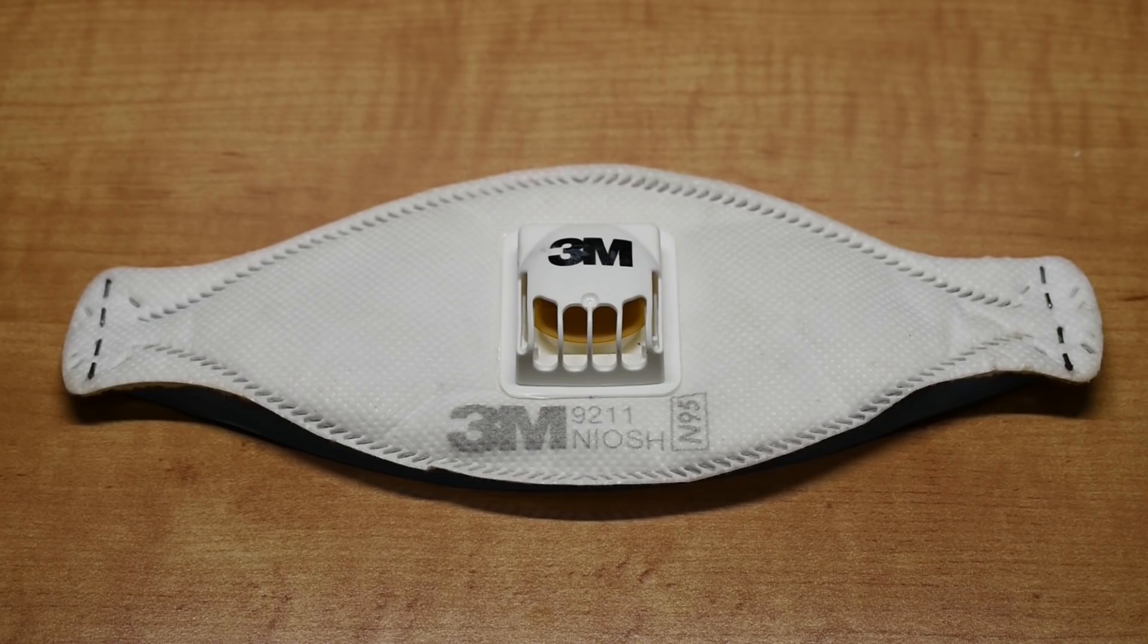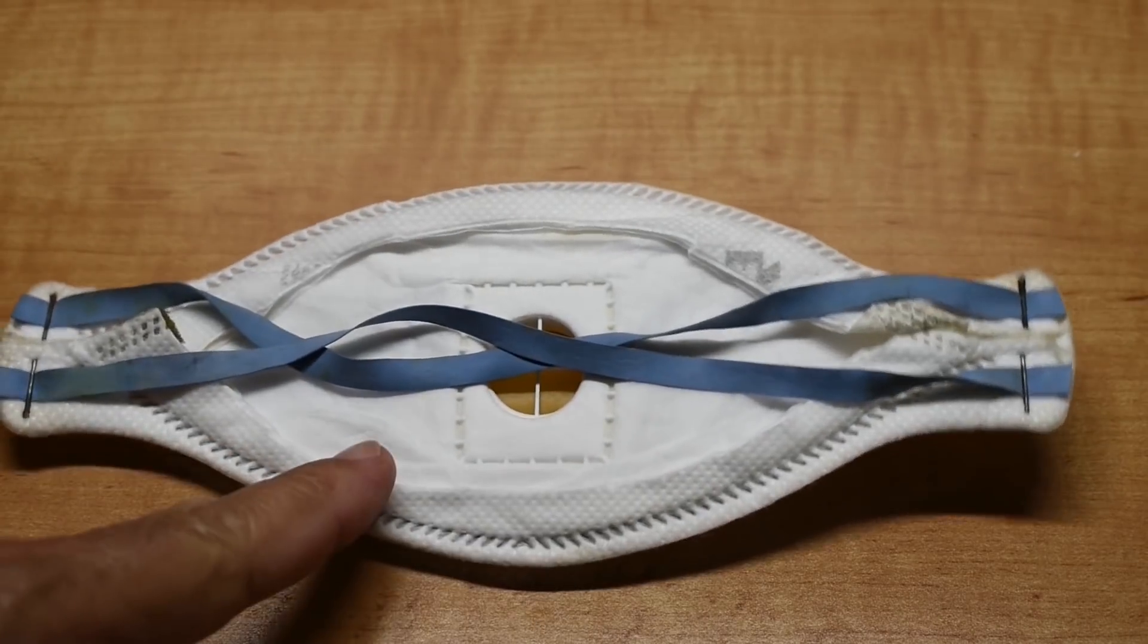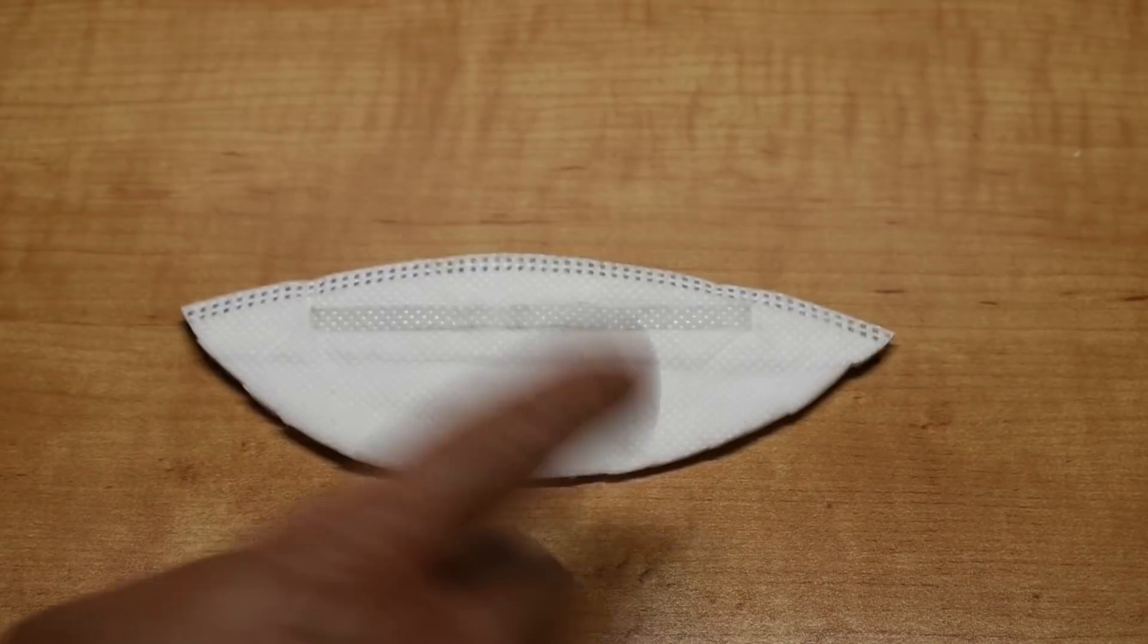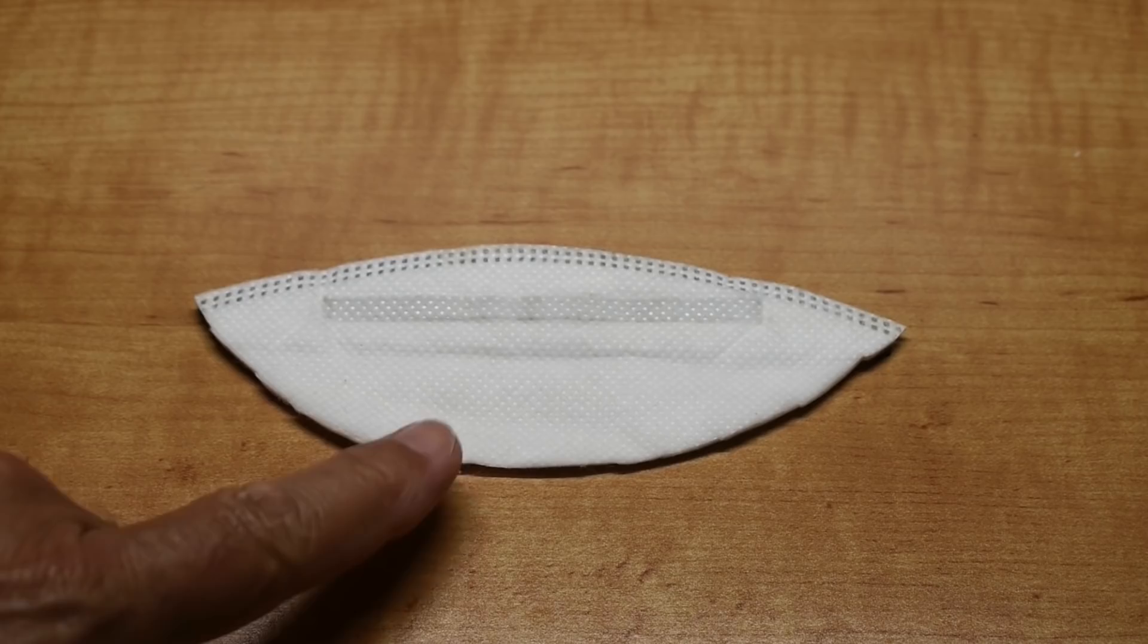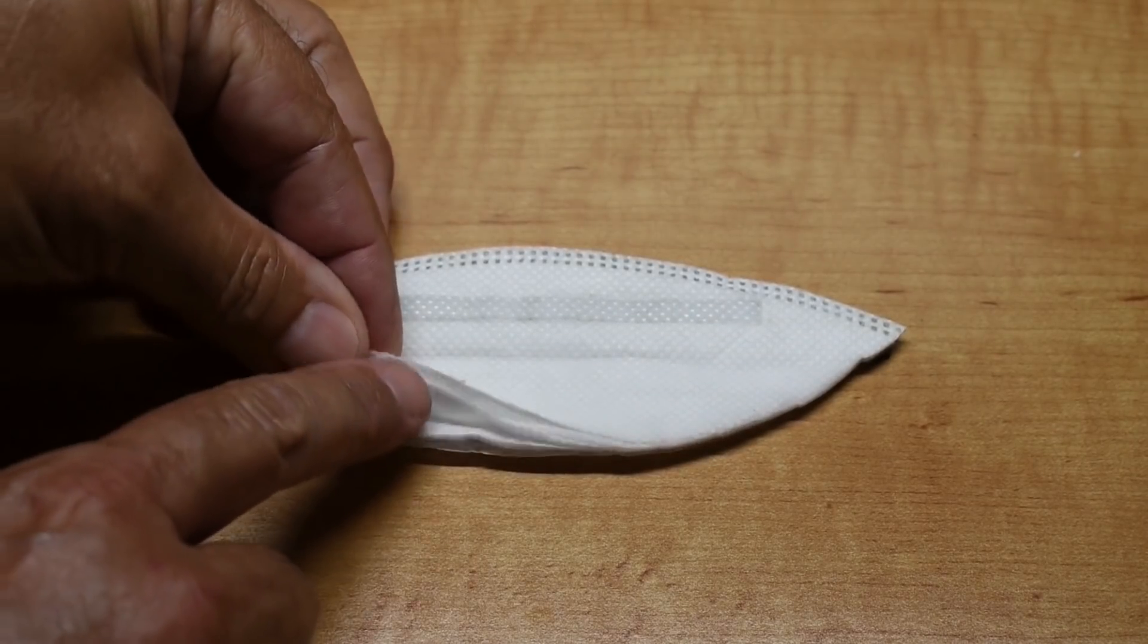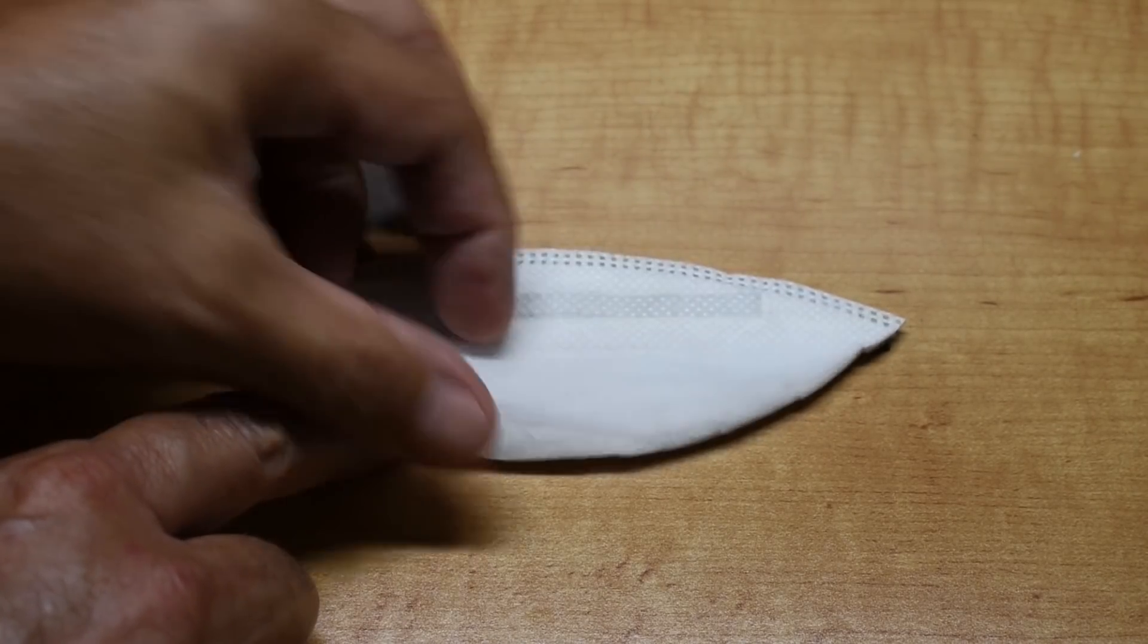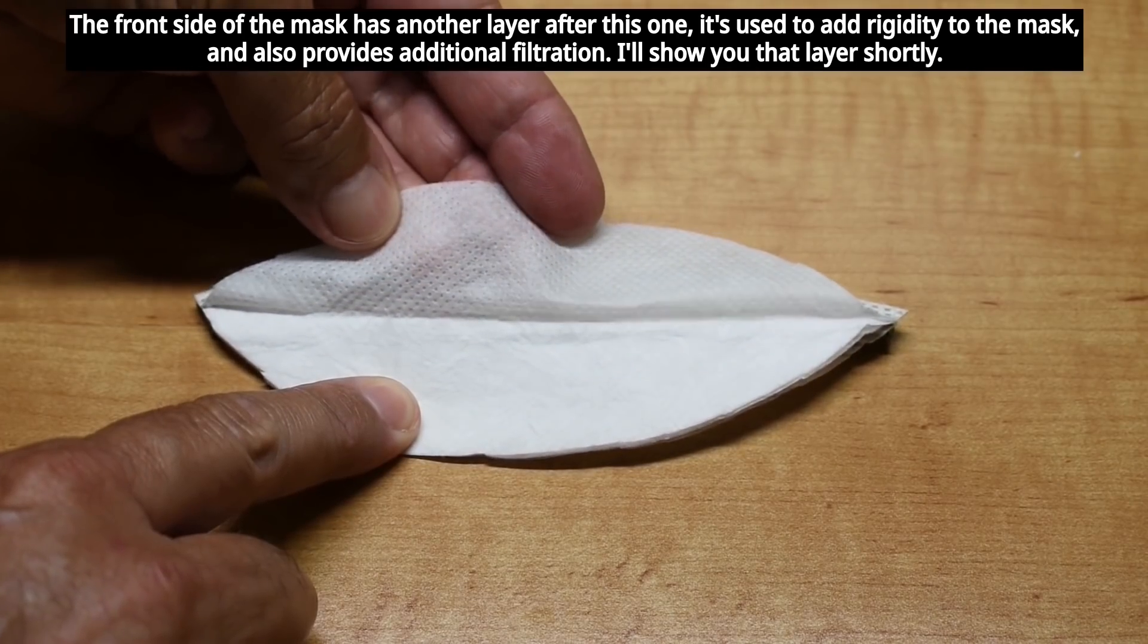In order to look at this under the microscope, on the back side I cut away all the fabric, and it's right over here. This right here is the outer layer. You can see through it a little bit.